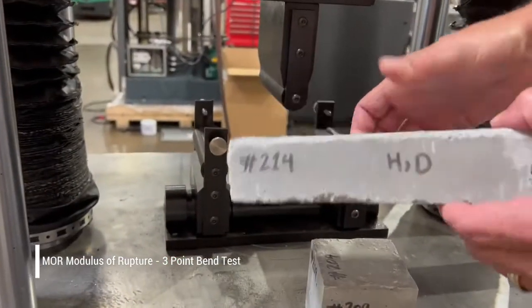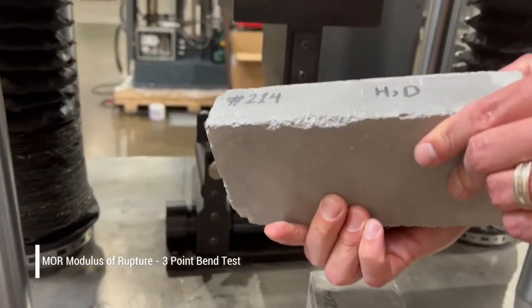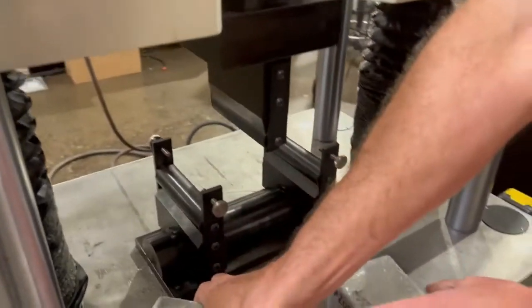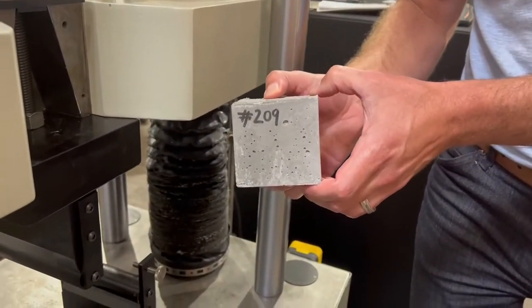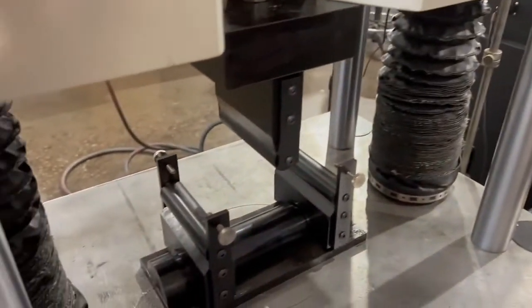This is a standard MOR brick that we're going to be testing, and this is your standard brick for your compression, which is the cold crush strength of this material.